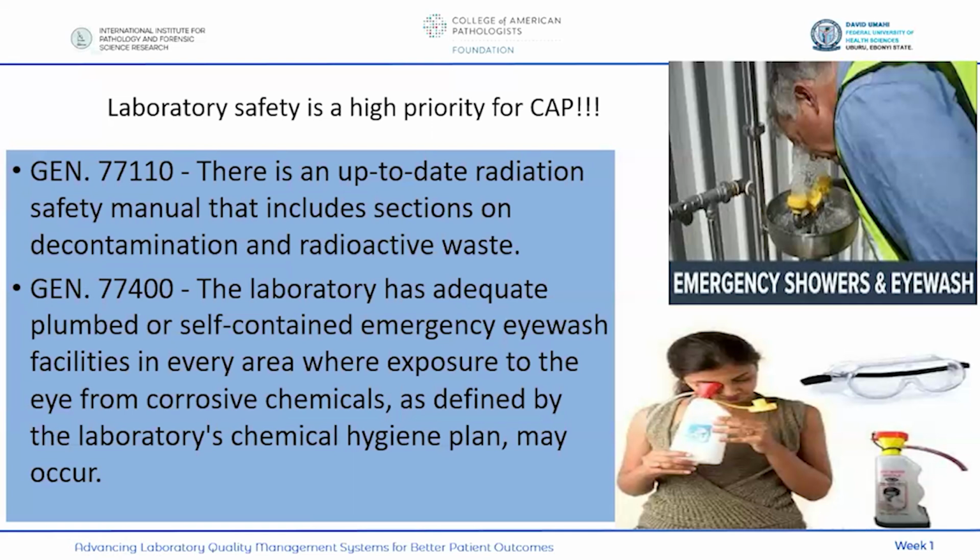But I know that in our own setting, many of us may not have this standard eye wash. So a lot of times we use the eye wash bottles. So this form that you see down here is mainly available in most of our laboratory settings. Okay, but it's important to have eye wash stations, and staff should be able to have immediate access to eye wash stations in case of any emergency.